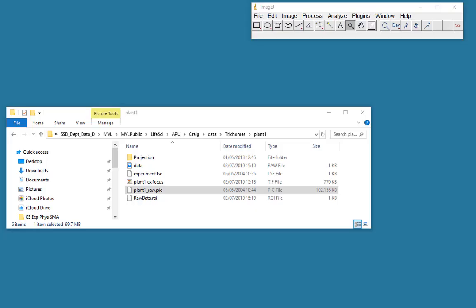In this short video, I'd like to show the process of making a Z projection. That is where we have a Z series, a series of TIFF images, and we want to make a single image which has all of the data within the Z series. It's like a 2D image of a 3D data set.